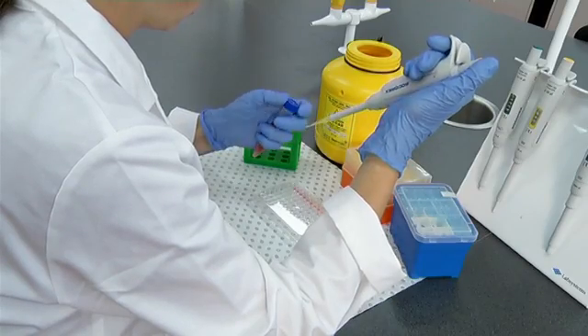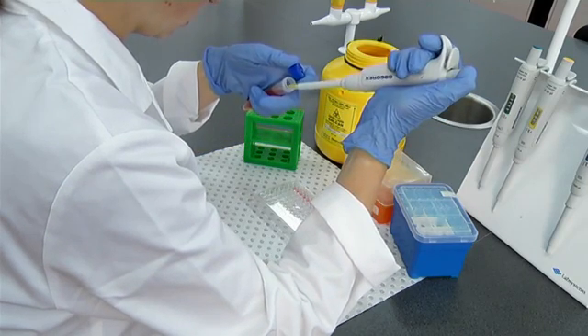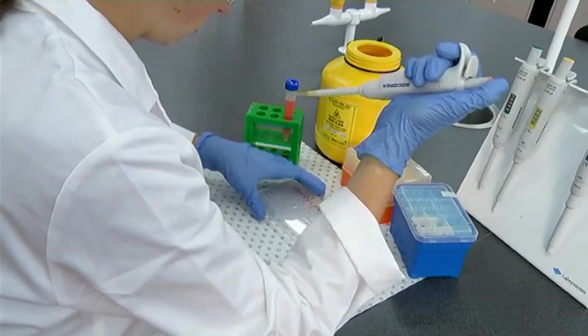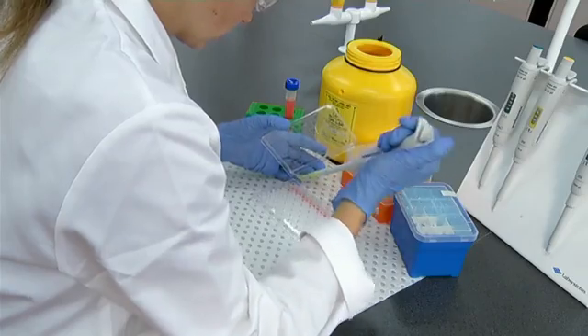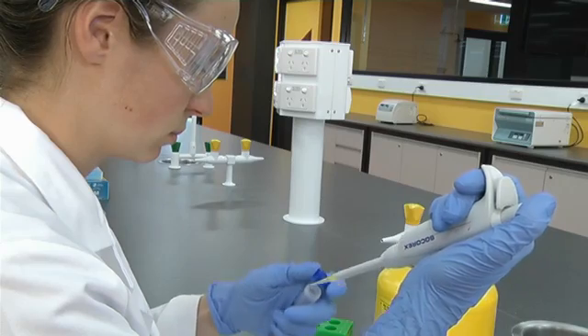There are a few things to be careful of to ensure accurate and precise pipetting. Always work comfortably — it often helps to have your arms supported and keep your workspace organised with your pipette tips, pipettes, and solutions at hand. You should watch closely when pipetting, particularly for small volumes. Bring the tip and tube close to your eyes; don't attempt to pipette at arm's length.